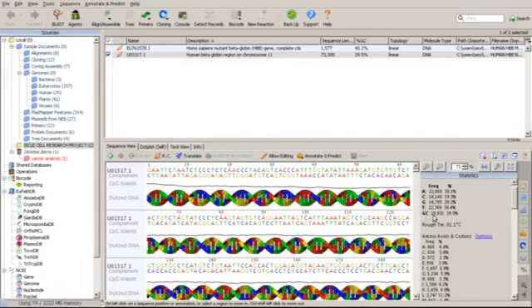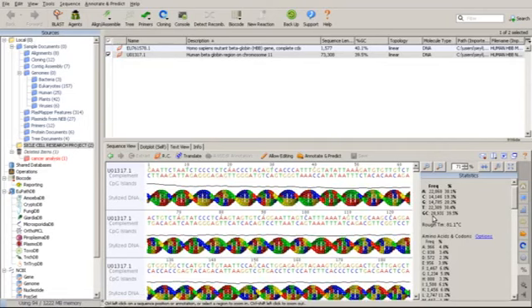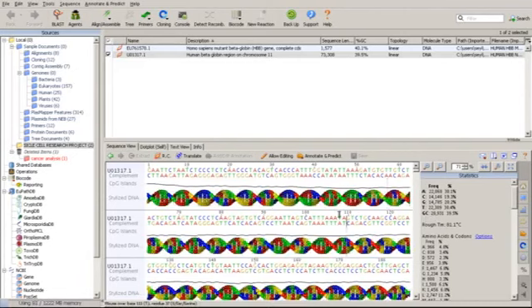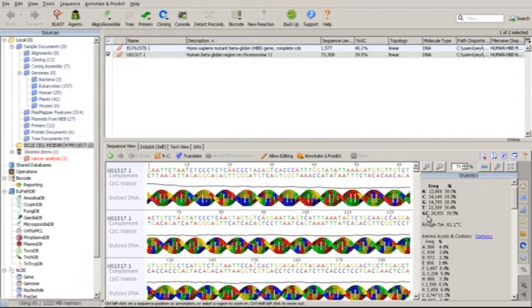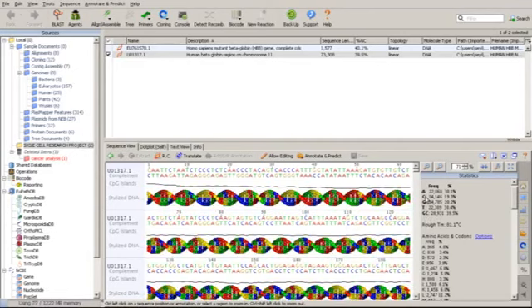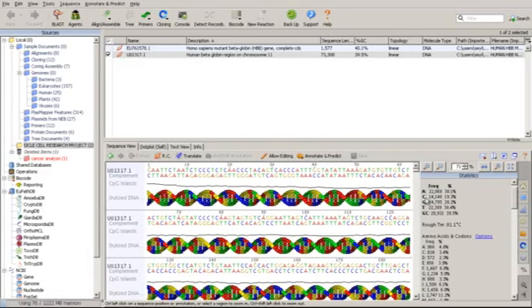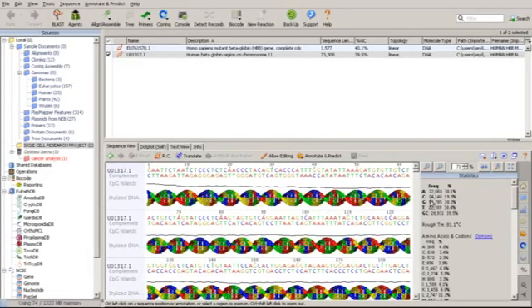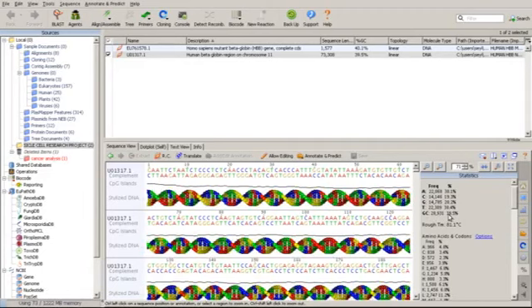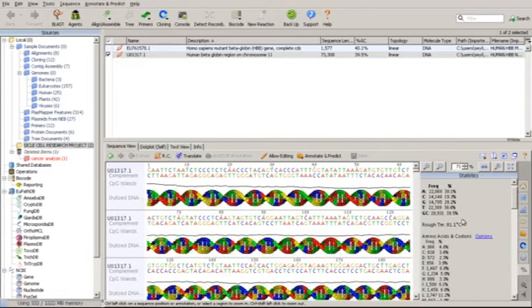The GC content helps us understand the extent, or the amount, of GC, which is guanine and cytosine, in the whole of this nucleotide sequence. You get the total number of GC content by adding the number of cytosine bases and that of guanine. You add them together to give you the total number of GC content and the percentage. The percentage is gotten from adding the percentage of guanine and cytosine together. So that's one thing about that.